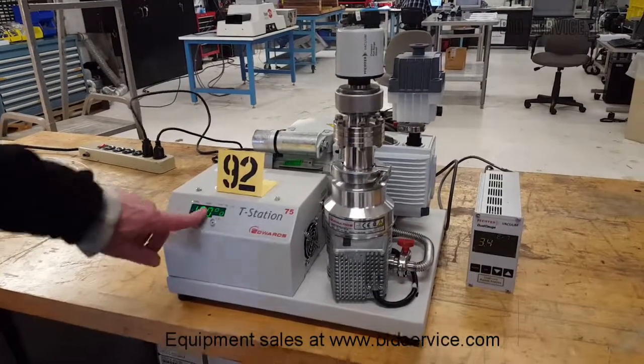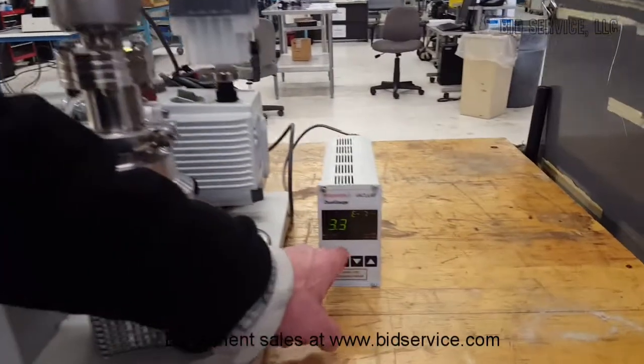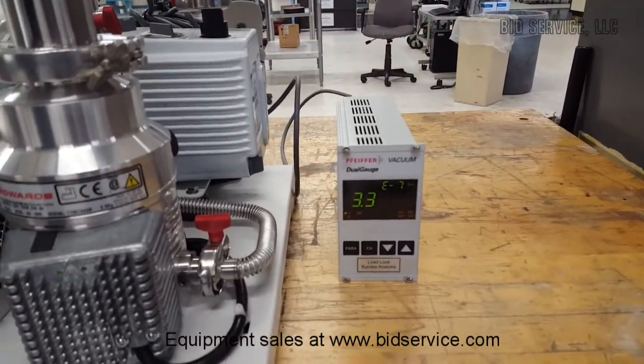It's been about 5 minutes. You can see we're up at 100% speed — it's been there for a while. Here's our vacuum reading: 3.3 times 10 to the minus 7.